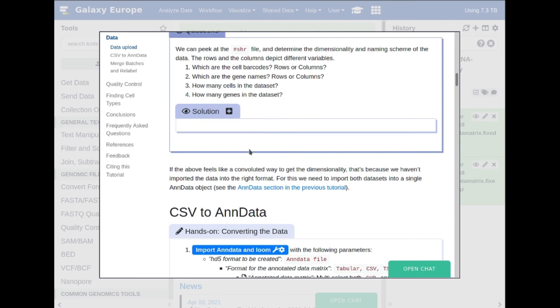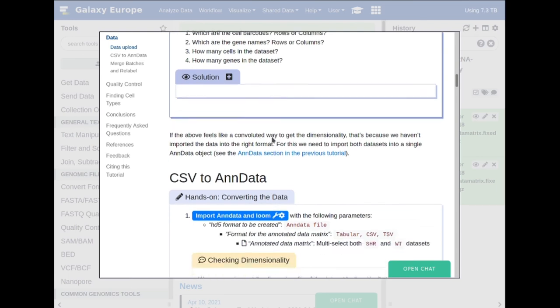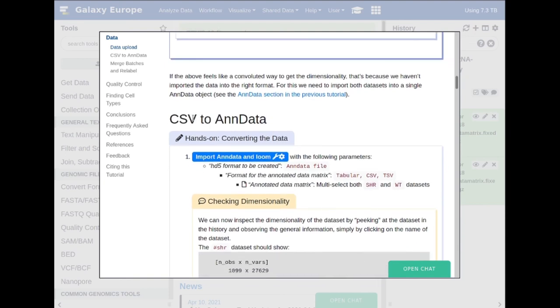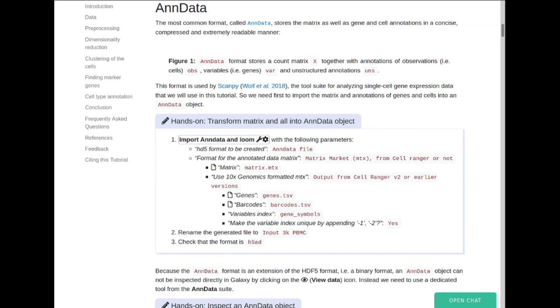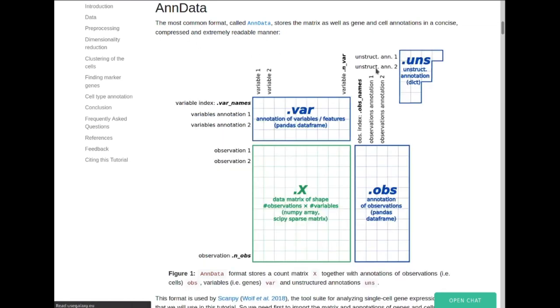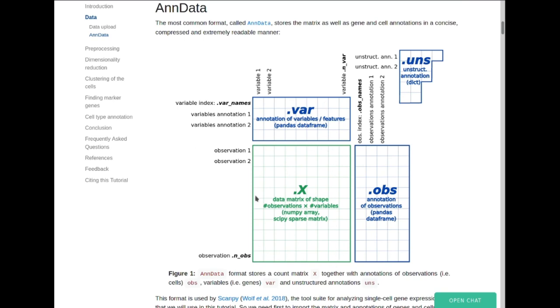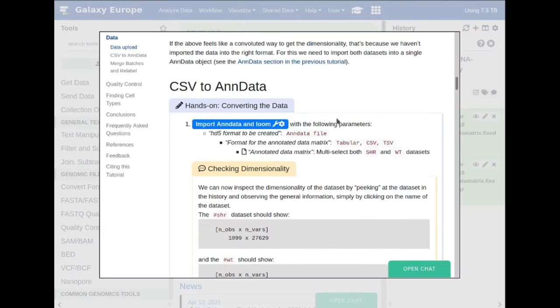This information will become more apparent once we convert them from their current CSV data type to the AnnData data type. If you're curious about what exactly an AnnData type is, please click on the link here, which should redirect you to the previous tutorial's relevance section. It shows that the main matrix is held in the X slot, observations about the cells are kept in a separate table, and variables are kept in their own table adjacent to the main matrix. Let's close that and do our first step.